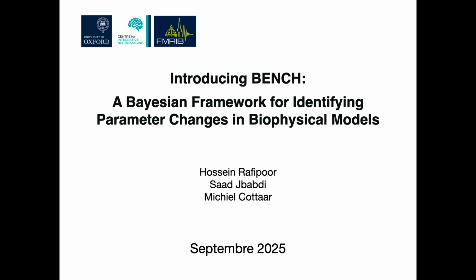Hi, I am Hossein Rafipour, and in this video I'm going to briefly introduce BENCH, that is a new FSL tool that uses a Bayesian framework for identifying parameter changes in biophysical models.